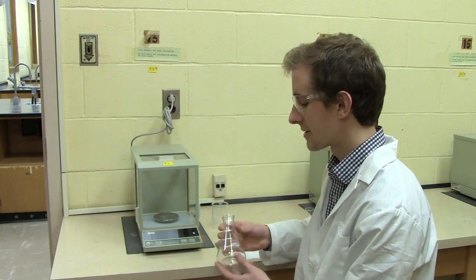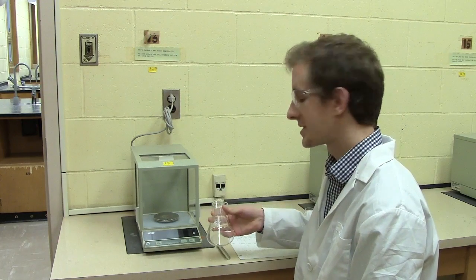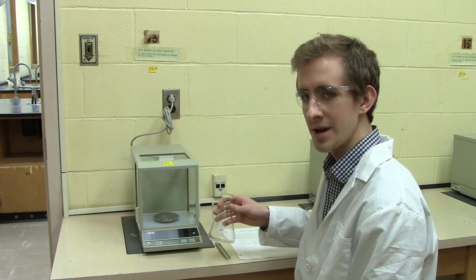You don't want to exceed the maximum load of the balance itself, so using Erlenmeyer flasks such as the 250 milliliter would be too much as it weighs over 120 grams in itself.